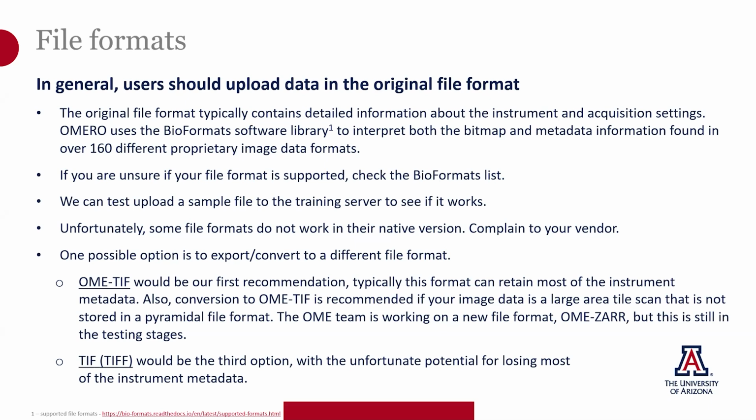The Open Microscopy Environment is also working on a new file format called OME-ZARR, but this is still very much in the testing stages. TIFF would be the third option, but unfortunately there's a very real possibility of losing most of the instrument metadata, particularly if you have multidimensional data.